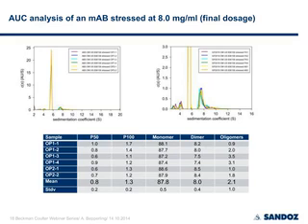You also can quantify dimers and also higher oligomers, although you may lose some precision at the higher oligomers because the baseline is ill-defined when you have a gradient formed by excipients. But it's still useful to see what is really going on in your formulation, also to see whether there are gross changes of the monomer-dimer content upon dilution or buffer exchange.